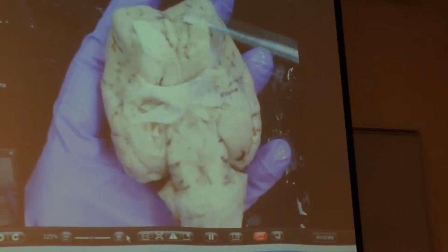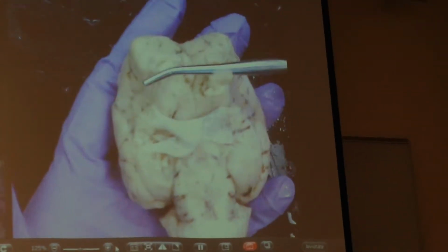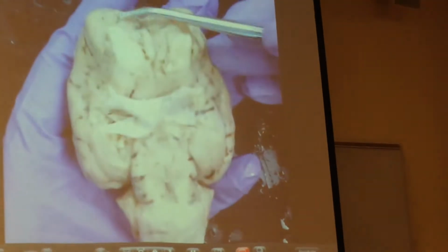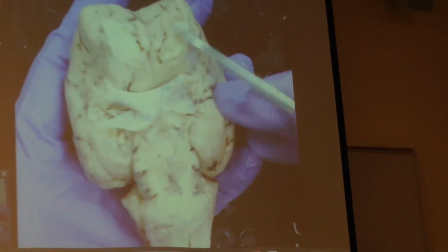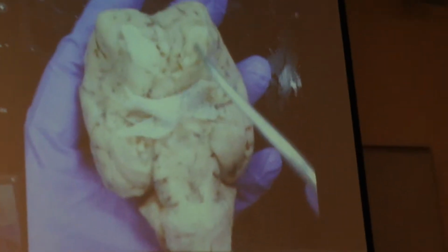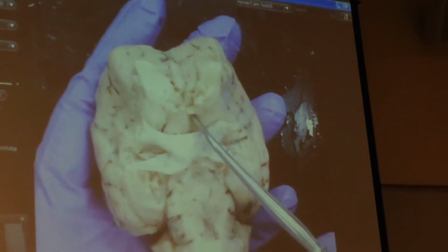If I turn this brain upside down, I can see various structures associated. First of all, I see these flaps right here on the anterior, or what we call the rostral portion of the brain. And these are the olfactory bulbs. So this right here is an olfactory bulb. This right here is an olfactory bulb. Can you see now where it goes towards the brain, towards this region? Those would be olfactory tracts.